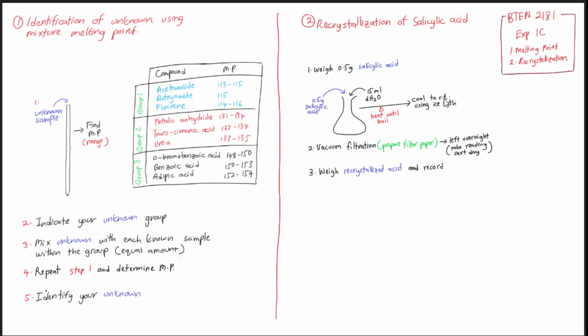Especially, for example, let's say the lab manual says use 10 gram, but during the virtual experiment later on, I will use 3 gram or 5 gram. So you need to reflect that in your lab report. Your lab report is based on what you see today.